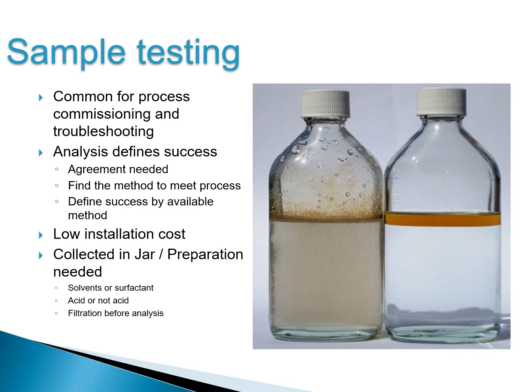The picture on the right has been treated with hexane. A known ratio of water to hexane is added to this bottle, and the bottle is shaken for about 2 minutes or so. Once it's set down, all the hexane floats to the top, and we have an oil-rich hexane sample that has virtually all the oil present in that original water phase.